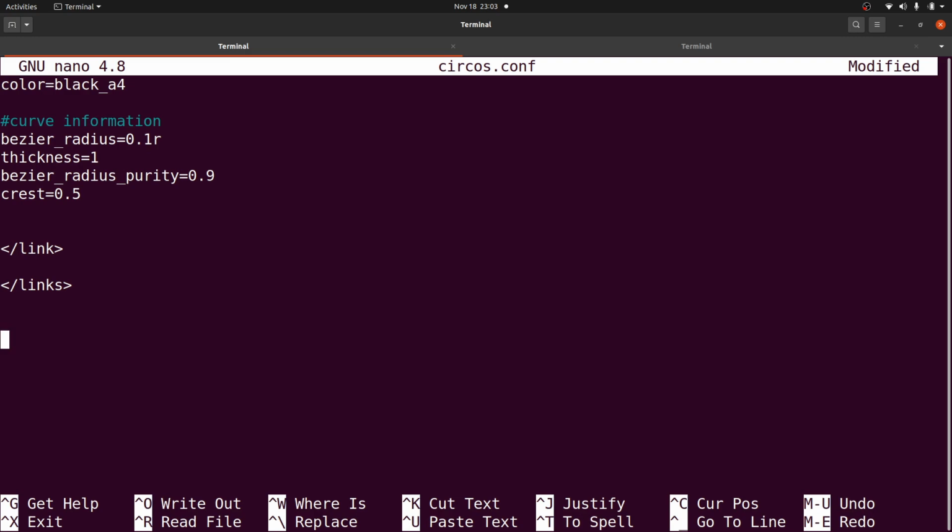So the GC Skew is a plot, so we have to define a plot block, right? So I'll add that here. I'll say plots, and I'll close it. And then we are going to give our subplots. Then in it, we will give our plots. So I'll start with this one here. It's file equals gc_skew.txt. And then the type is equals to what? Line.